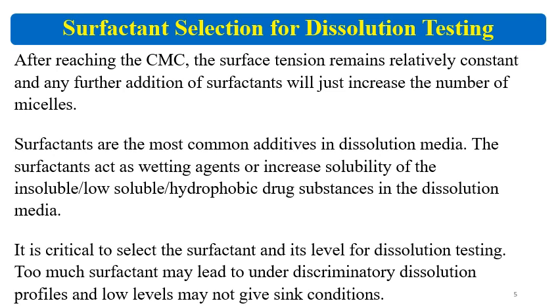Surfactants are the most common additives in dissolution media. The surfactant acts as a wetting agent. These also increase the solubility of insoluble, low soluble, poorly soluble or hydrophobic drug substances in the dissolution media.